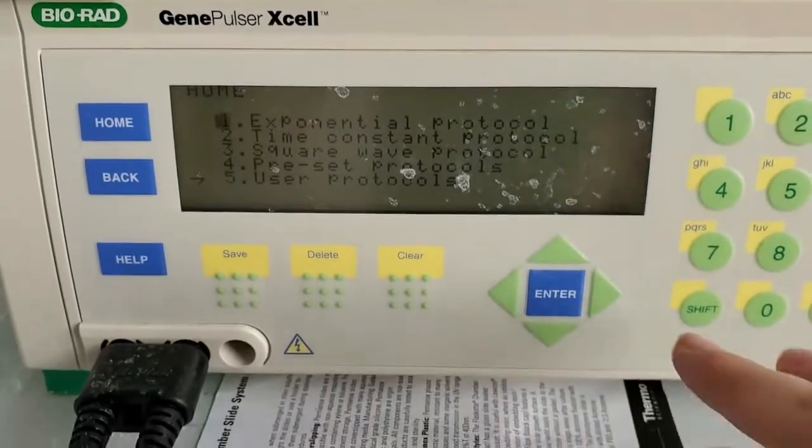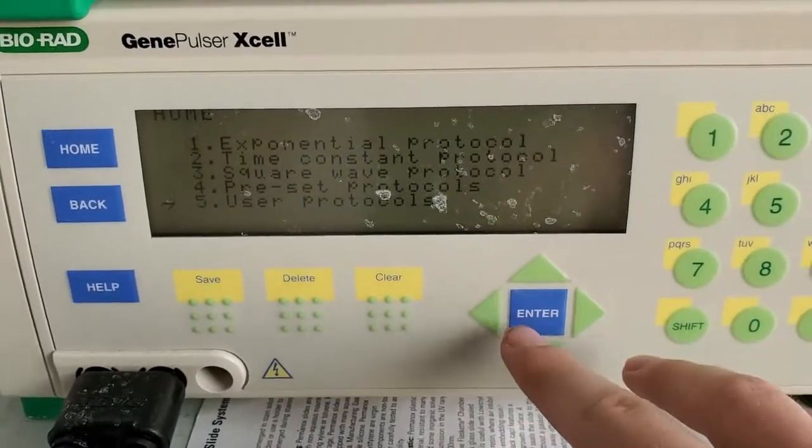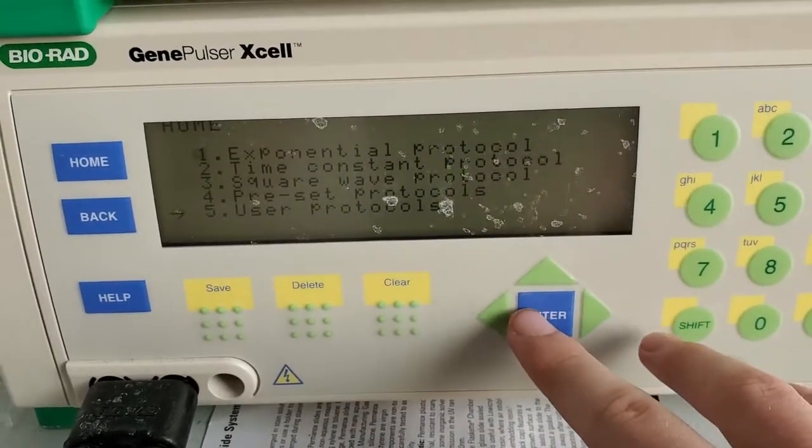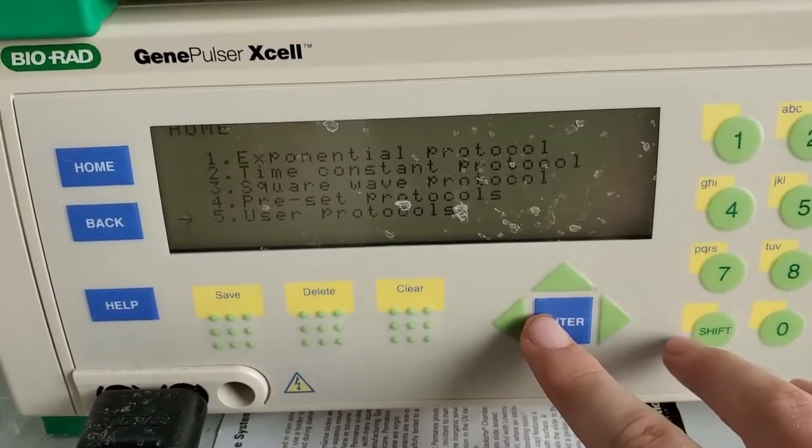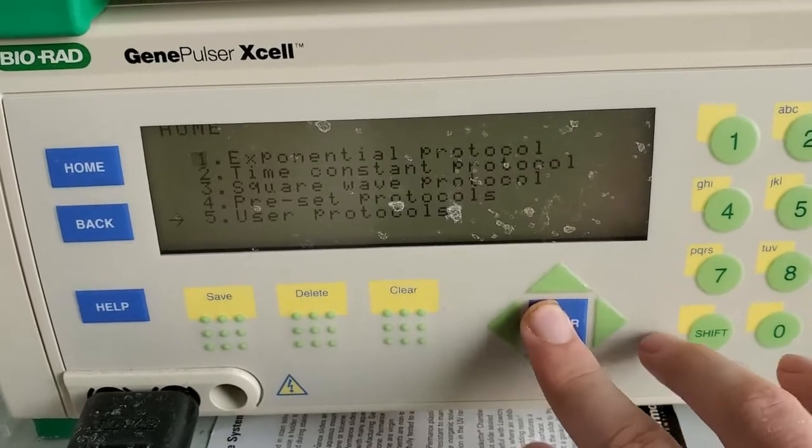Then you can go ahead, use the controls, select the protocol. So just go for an exponential protocol.